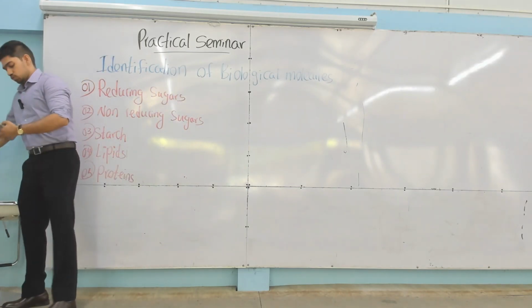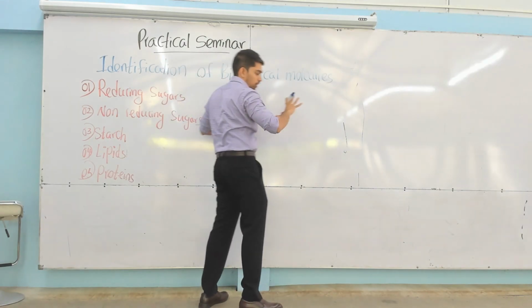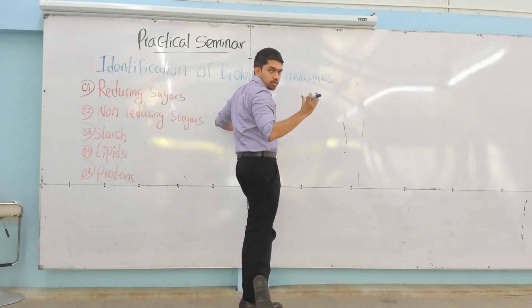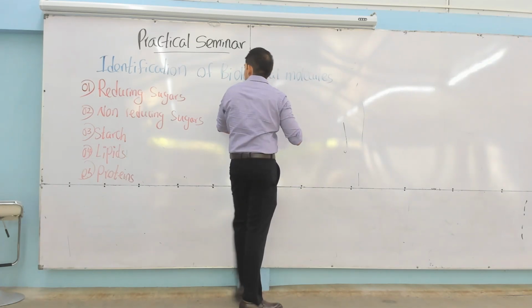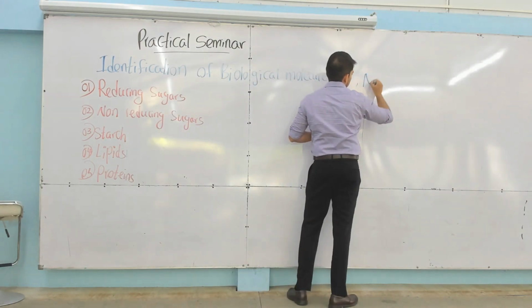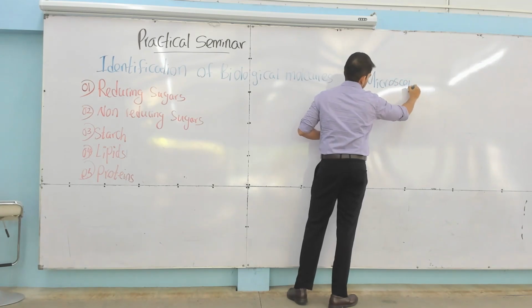I have most of the things to perform all these practicals, and I brought a microscope as well. Do not ask me how I got it. So this is the first part. Part 2 is simply the microscope.